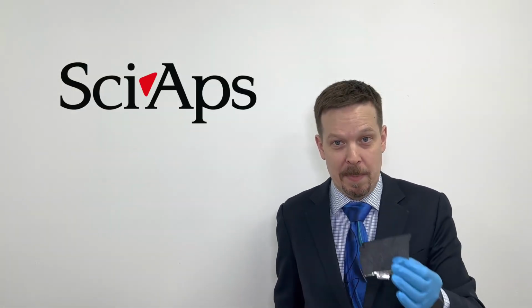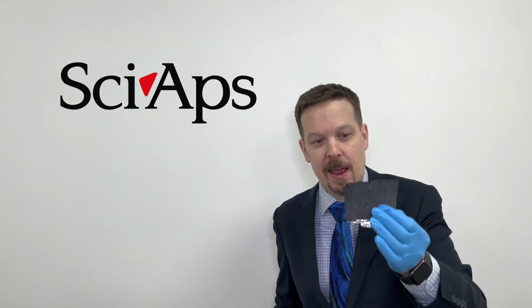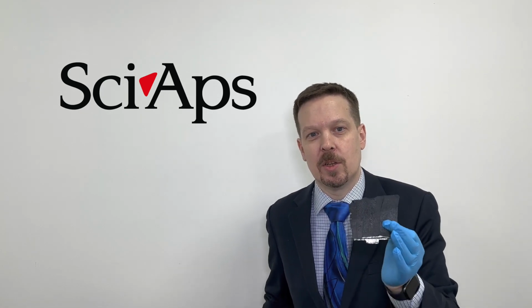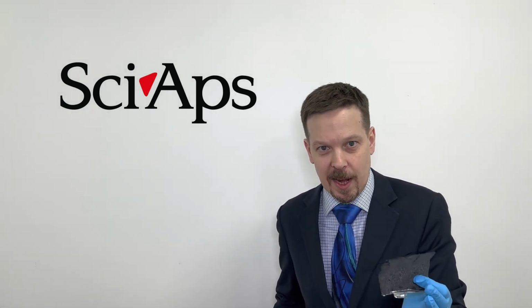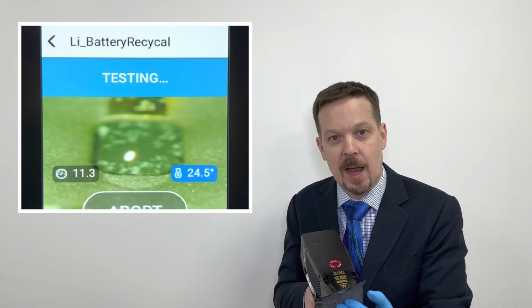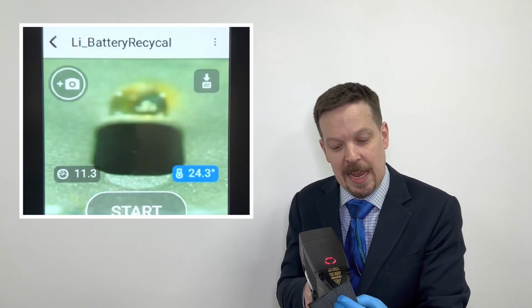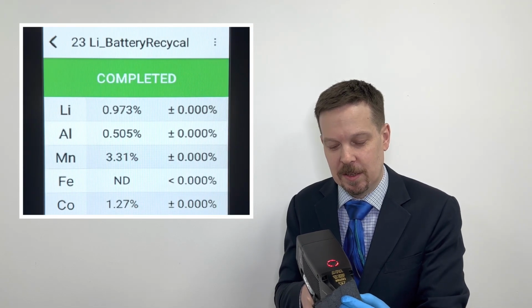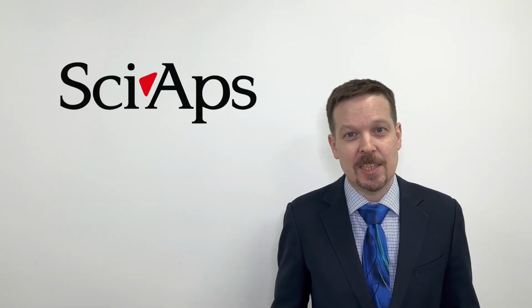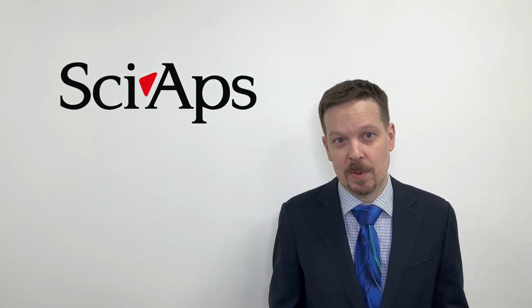You can also grab many components and take repeat shots. So we'll take this sample and we'll test it on multiple locations to look at the consistency of results that we're getting with this type of analysis. So we'll start off by taking one shot, and then we'll repeat that shot again and do it at a different location and see the consistency between the two results that we're getting. So that just gives you a brief example of all the applications that you can do with TMA.